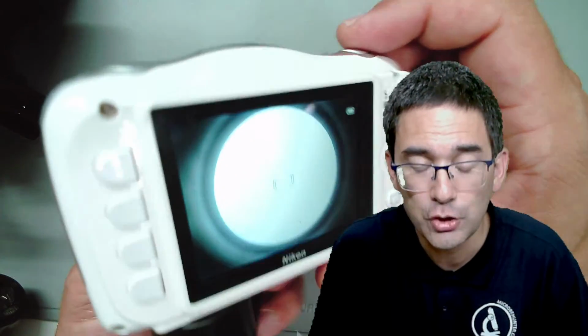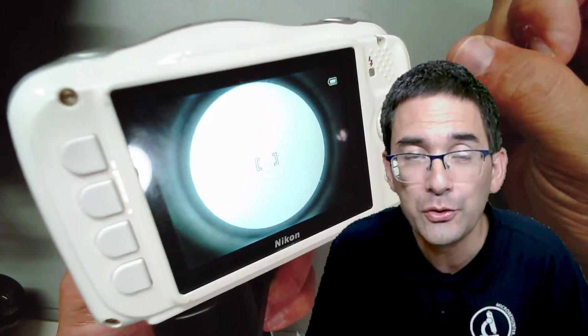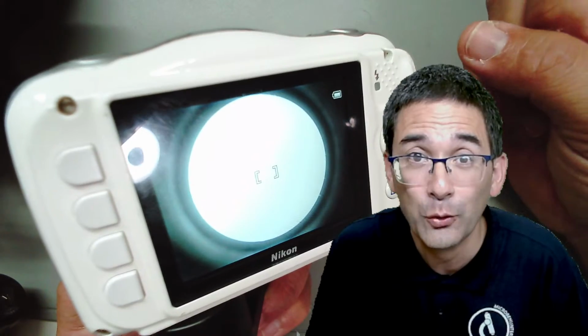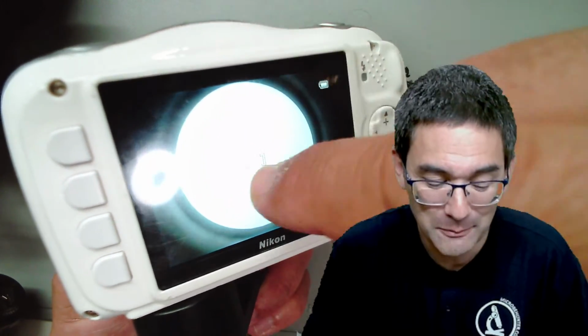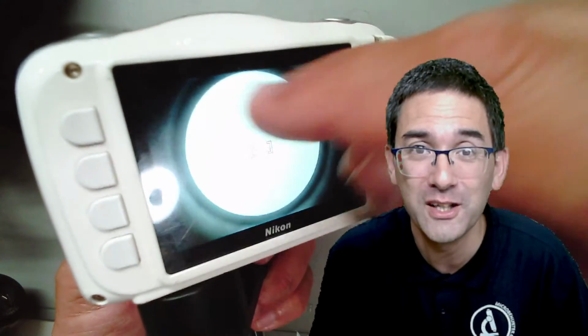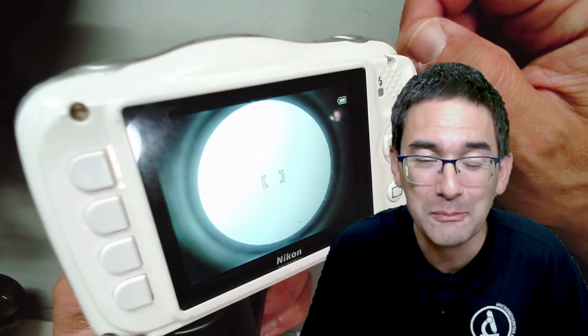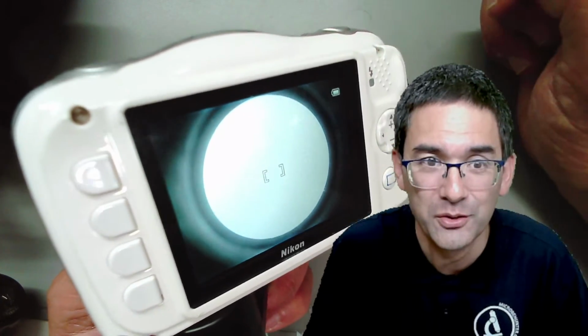Disadvantage here is that if you make a video, some of those compact cameras do not allow you to fix or to adjust the focus. So manual focus is not possible. So if you change the focus of the microscope, sometimes it gets confused and it tries to refocus. This can be a little bit annoying, because the camera thinks everything is out of focus, and then it tries to adjust the focus on its own.